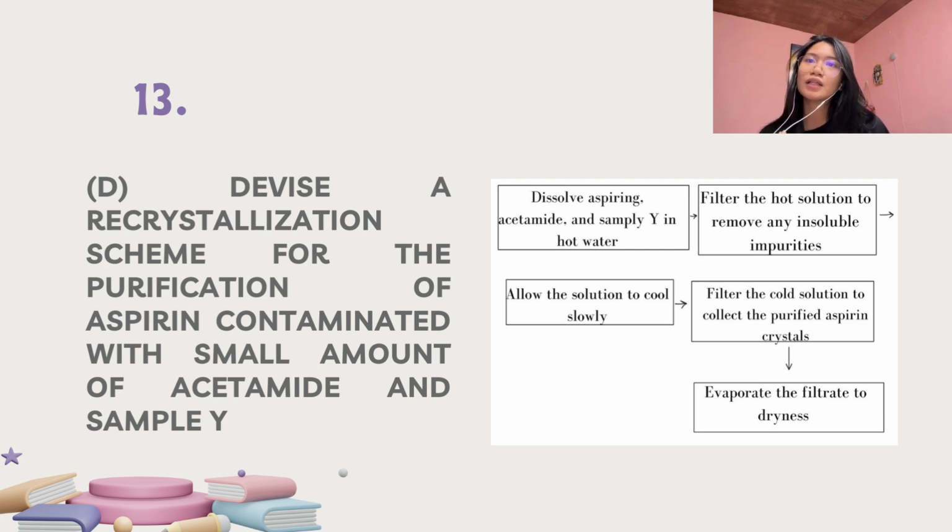Finally, the liquid left over after filtration may contain acetamide and sample Y. You can evaporate the filtrate to dryness to recover any remaining acetamide or sample Y, but it is unlikely that you will be able to separate them from each other using this method.